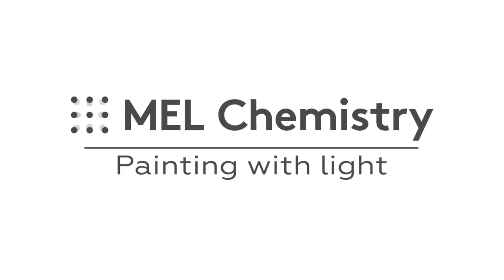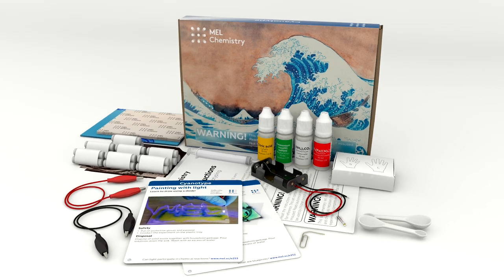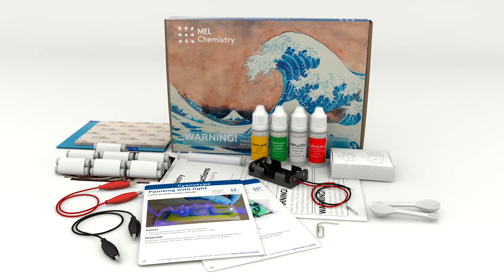Welcome to the wonderful world of chemistry. Today, with the help of the cyanotype set by Mel Chemistry, we will learn how to draw using light.